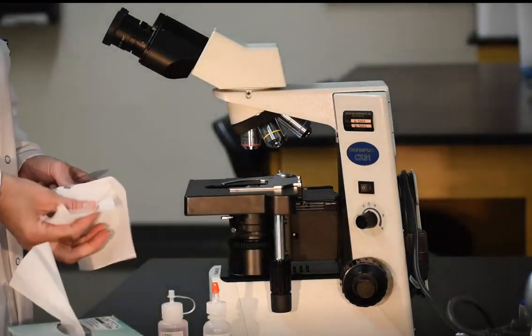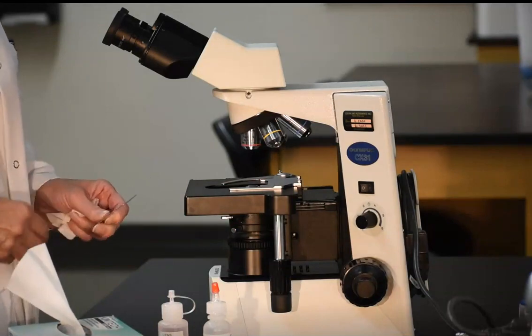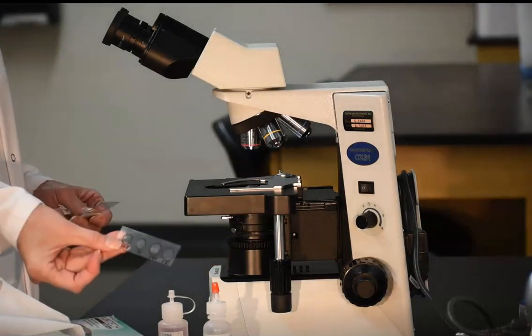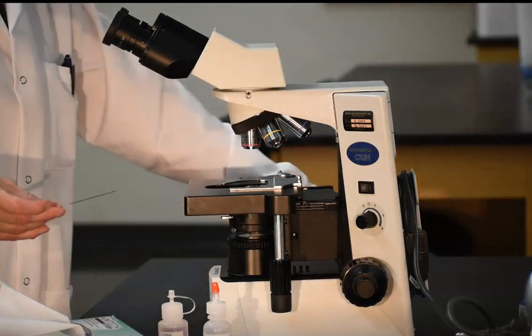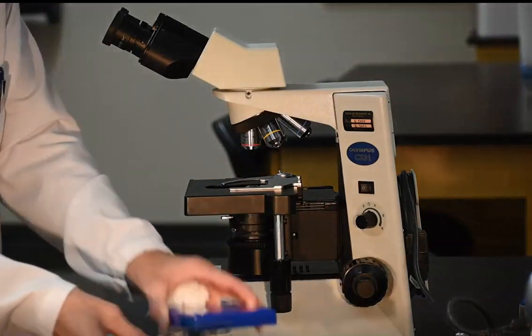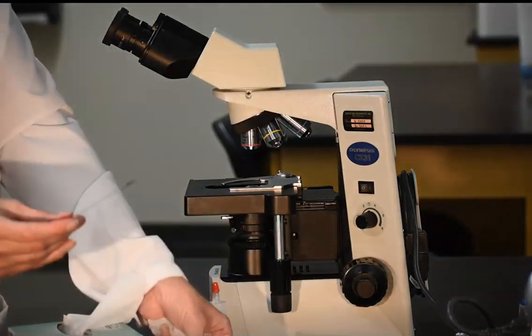If it is a slide that you prepared in lab, such as a stain, you can't wipe it or you will remove your work. Simply tilt the slide and allow the oil to drain on paper. You can keep the slide in a box with an absorbent layer to capture the draining oil for future viewing.